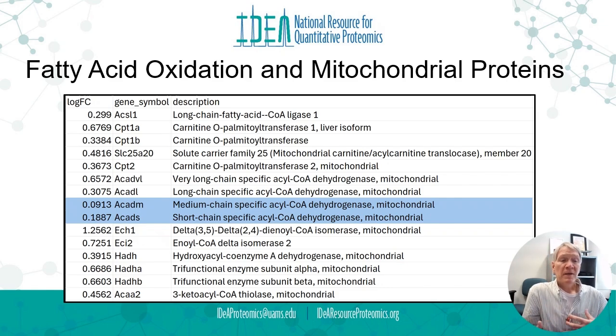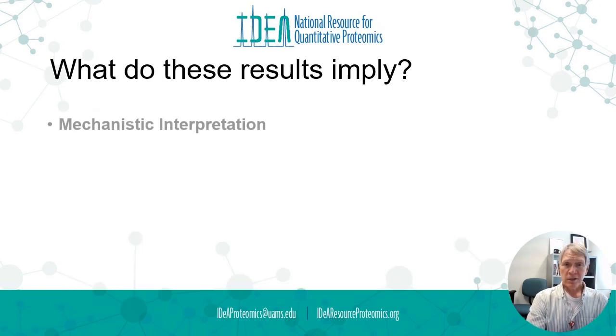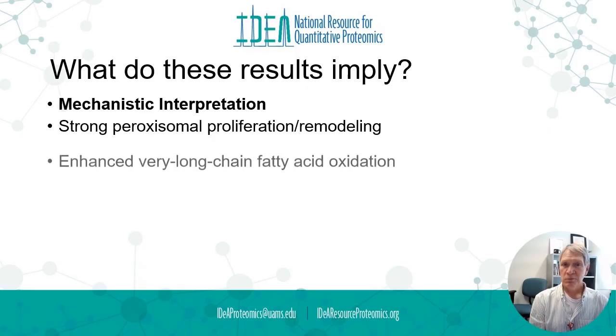having to assimilate more of those long chain fatty acids. And so we would expect those proteins to be upregulated because of the change in diet, and we just showed that. Well, what do these results imply?